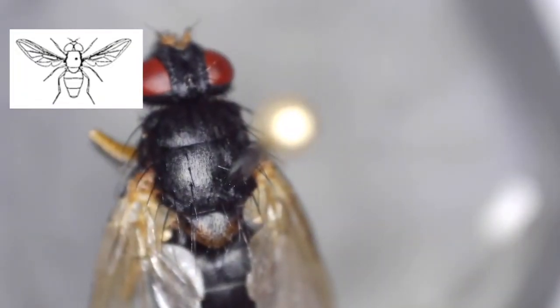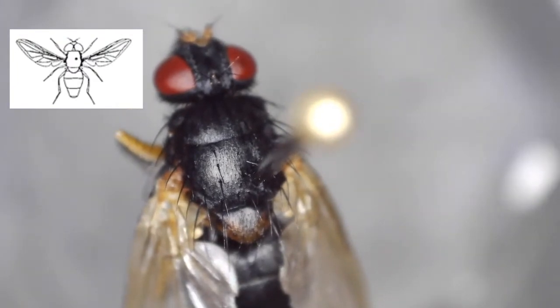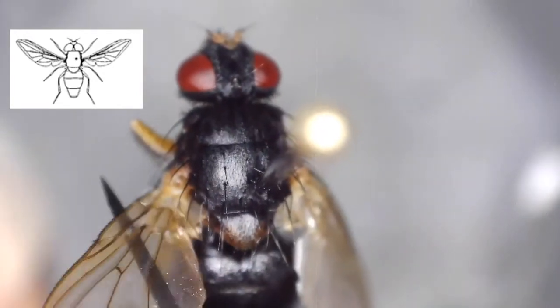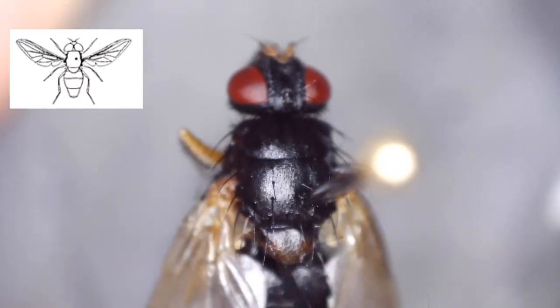So flies only have one pair of wings, but they also have one pair of sort of gyroscoping balancing apparatuses that are known as halteres. These allow the fly to balance in the air. It makes them very acrobatic. It allows them to sense air currents.